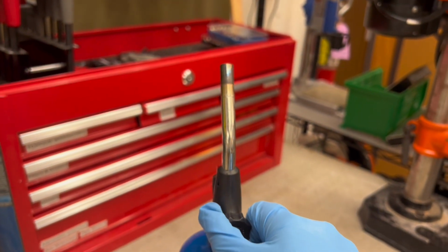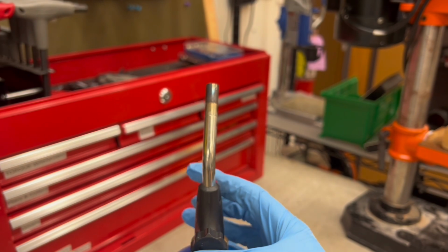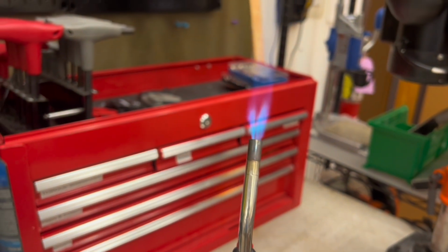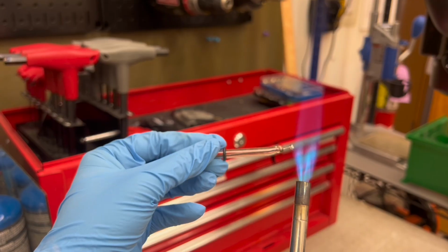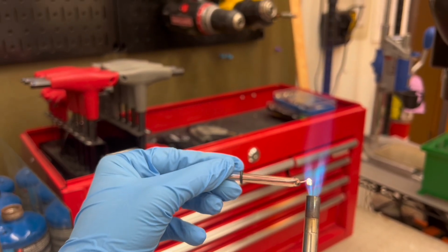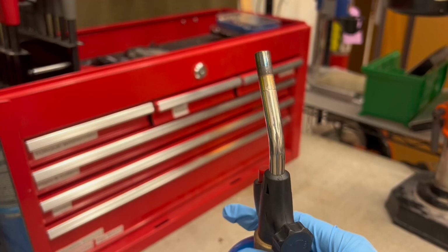For the counter electrode, we'll rinse it with water and dry it with a Chemwipe, and then ignite the counter electrode with fire. Make sure the glass part does not touch the fire, or it will be very dangerous. When we observe the wire change color, it means the electrode is ready and we should turn the fire off and get it back.